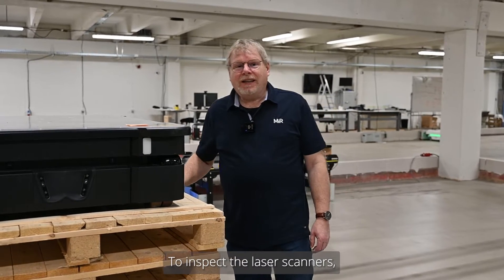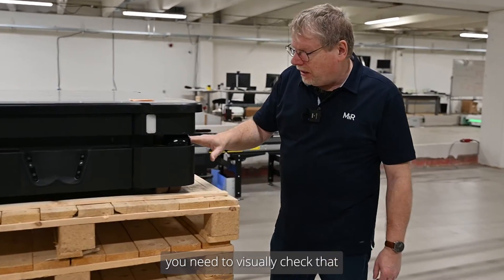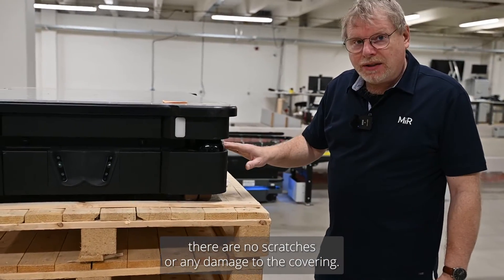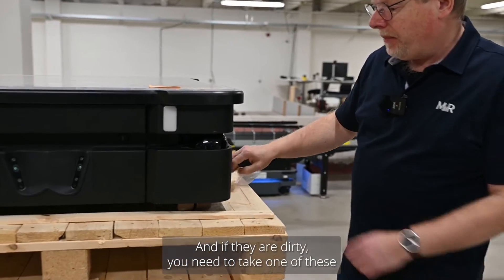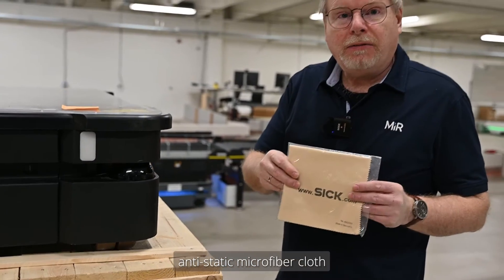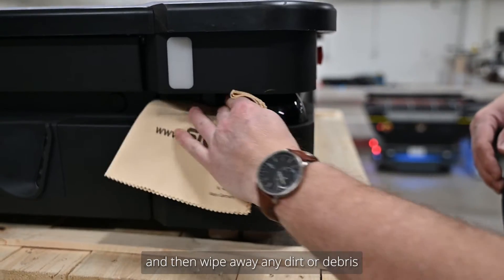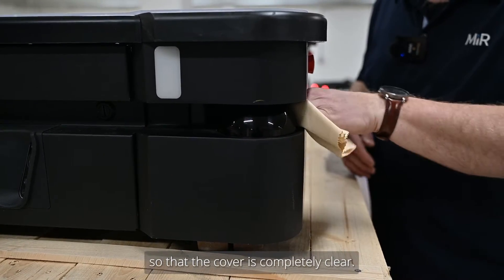To inspect the laser scanners, you have one at the front left and one at the rear right. You need to visually check that there are no scratches or any damage to the covering. If they are dirty, take one of these antistatic fiber cloths and wipe any dirt or debris so that the cover is completely clear.